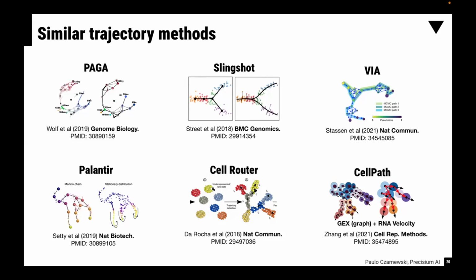Yeah, so I see your point, and you're definitely absolutely correct on that. Especially, for example, in this case, let's say that they are not connected. You probably don't even have the intermediate, but then you're trying to fit trajectories onto cells that actually don't make any sense. Let's say, oh, I want the neutrophils to give origin to the T cells because they are close in space for some reason. That does not make sense. So always be careful when fitting the trajectories. And perfect note there from you. Thank you.